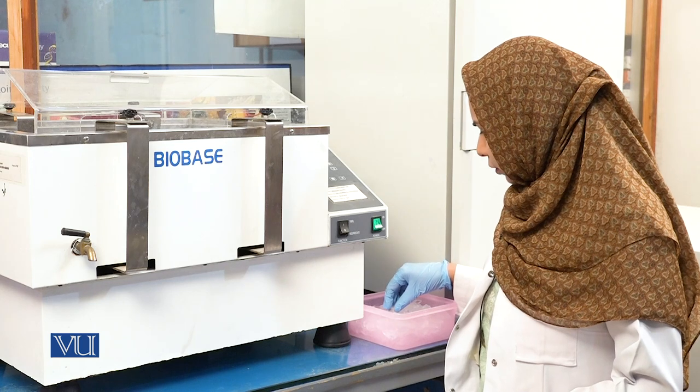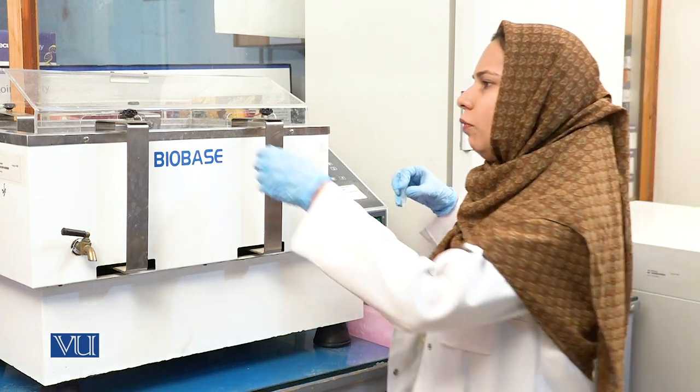Transformation of bacterial cells through the heat shock method is called heat shock because we give the transforming cells a shock of 42 degrees centigrade. For this, we need a water bath. So after incubation of competent cells with the plasmid DNA, we will give a shock of about 1 minute. And for this, we need to put the bacterial cells from ice into the water bath.